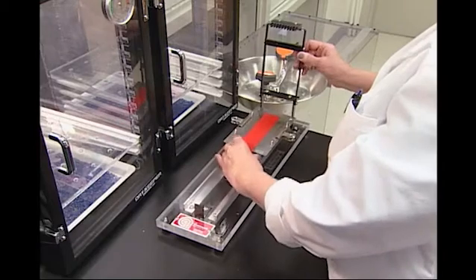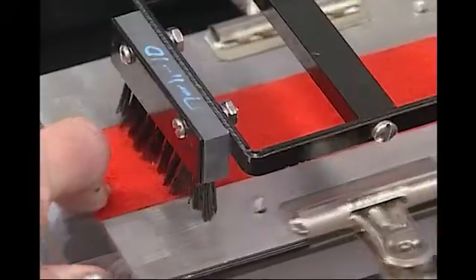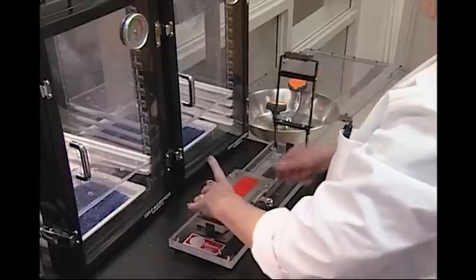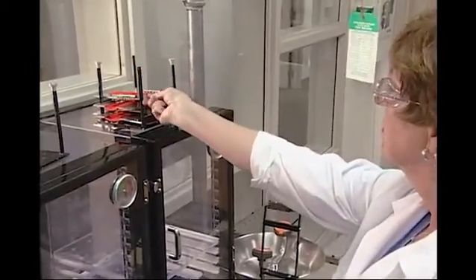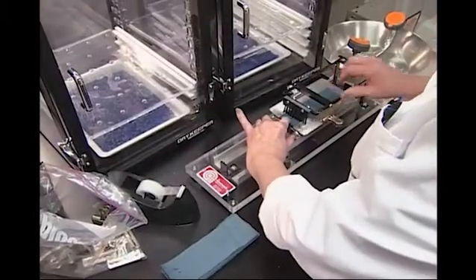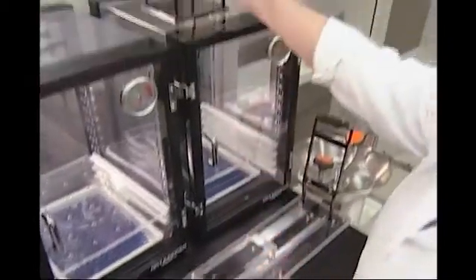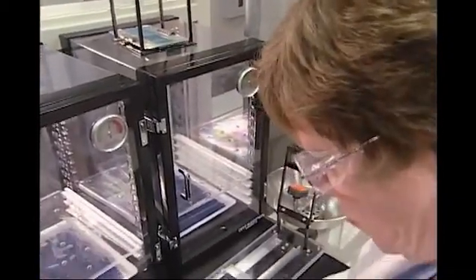Raised surface fabrics also must be brushed using the brushing device. This device consists of a base platform over which a hinged brush is attached to a carriage that allows the brush to be pulled along the surface of the specimen mounted in a test holder. Although specimens from plain surface fabrics do not have to be brushed, the brushing device platform is used to mount specimens into the test holder to align them correctly for consistent flame impingement.